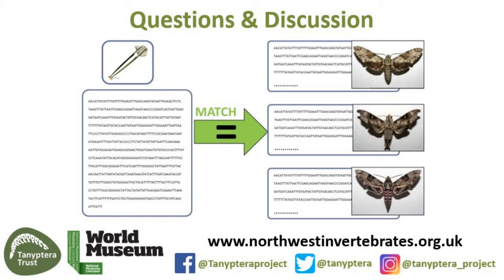Okay. Got a question from Diana. Is it possible to get estimates of abundance from the metabarcoding studies?